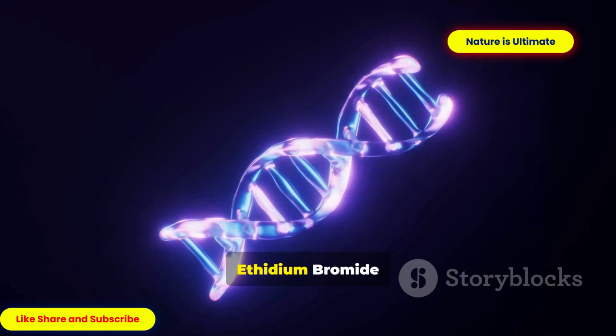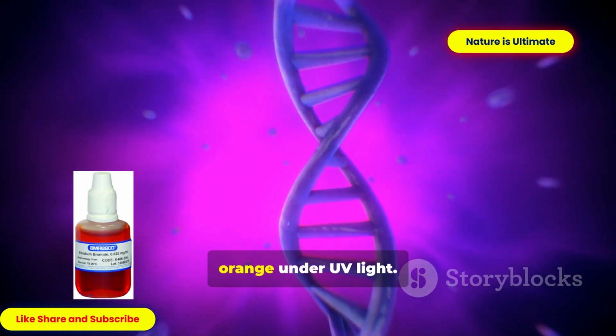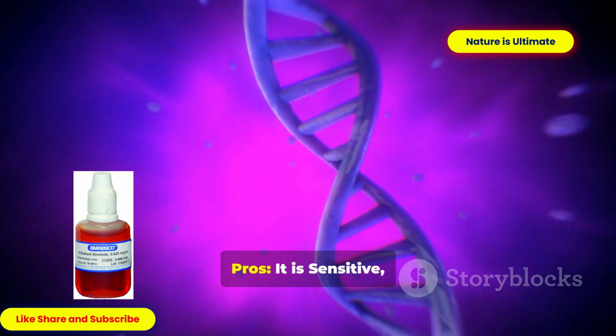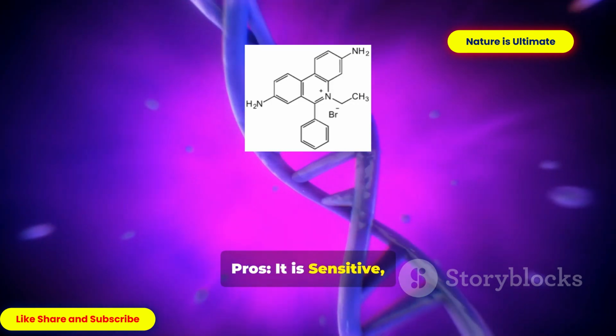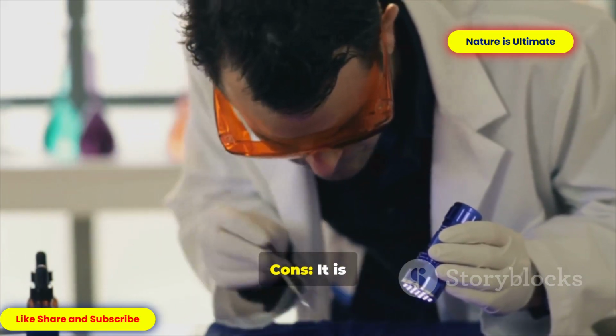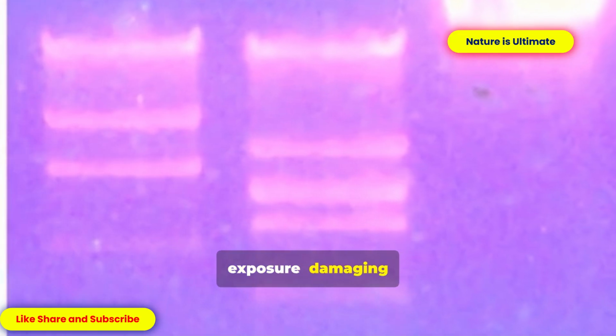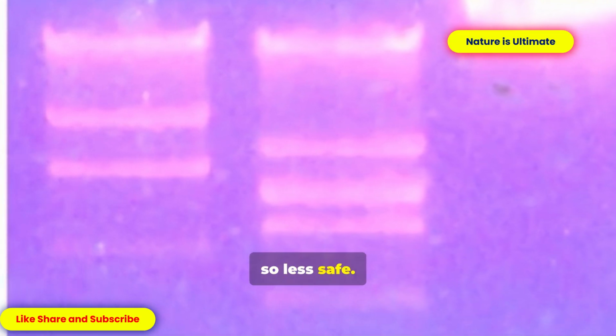Principle: Ethidium Bromide intercalates between bases of nucleic acids and fluoresces orange under UV light. Pros: it is sensitive, cheap, widely used and works with both DNA and RNA. Cons: it is mutagenic and carcinogenic, requires UV exposure, damaging to DNA, so less safe.